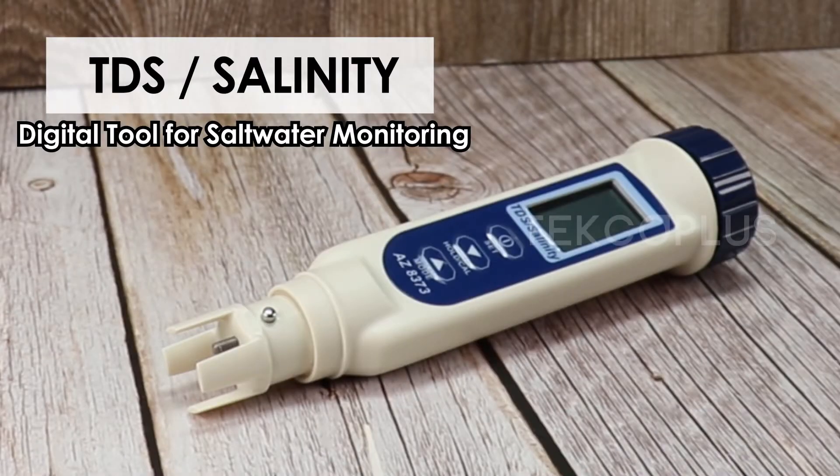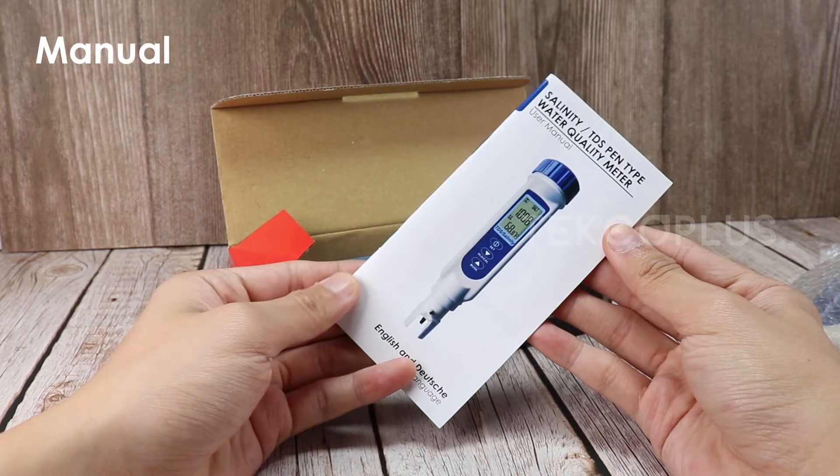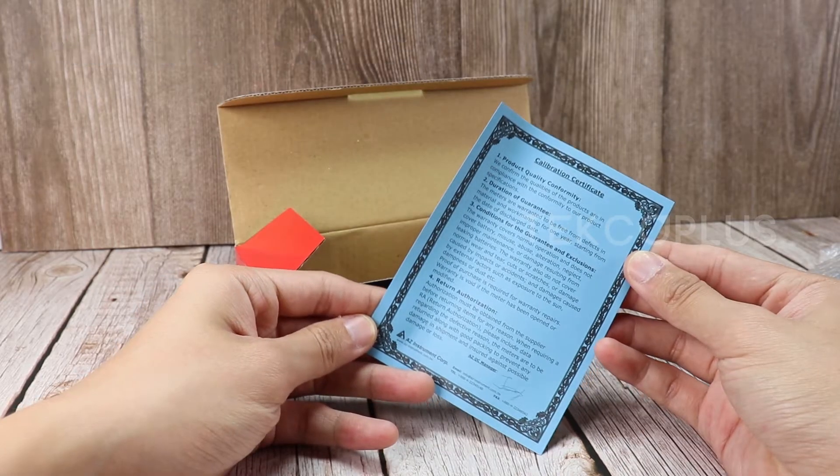TDS/Salinity Meter — a digital tool for saltwater monitoring. The set includes our box, guide, batteries, manual, certificate, and TDS meter.